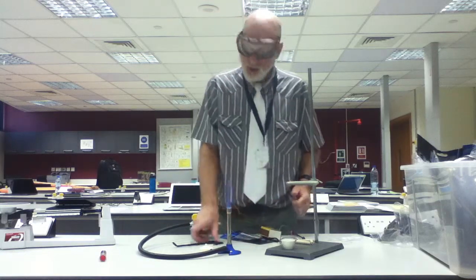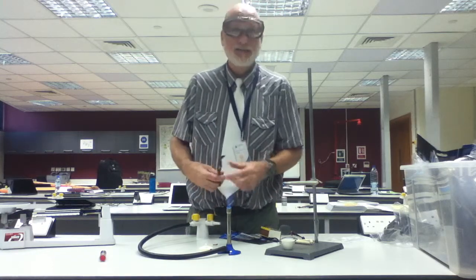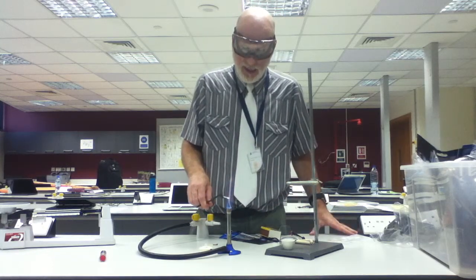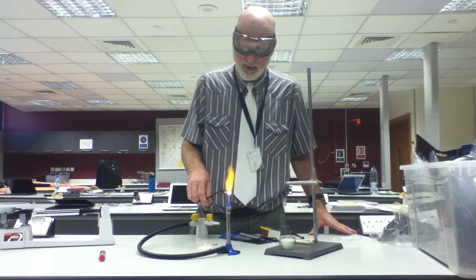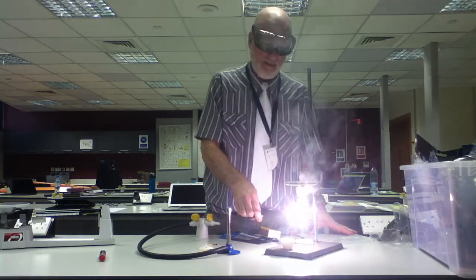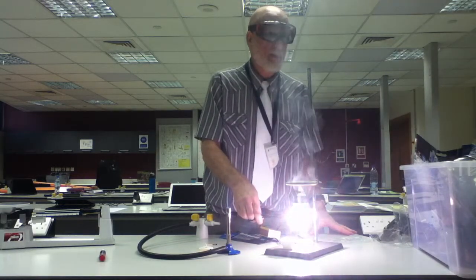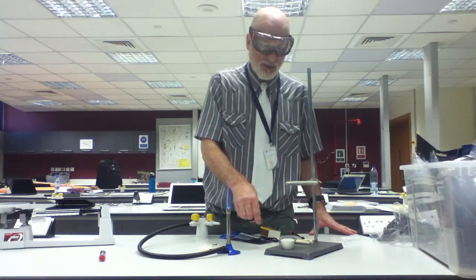Okay, so you don't want to look directly at the flame. This is going to burn white hot, and it looks hot, and it is actually very hot. So I'm going to put it right at the top of the inner flame, and you see the white. You see that? Don't look directly at that flame. And you'll see that it's burning very hot. That's the actual reaction that you're doing.